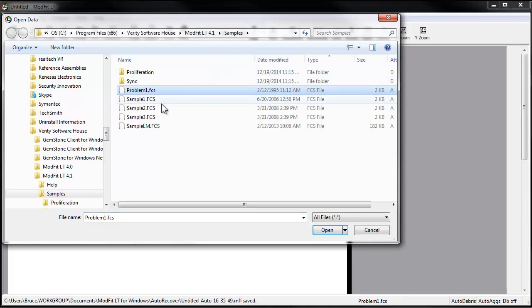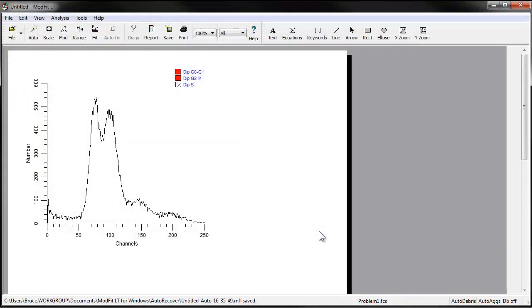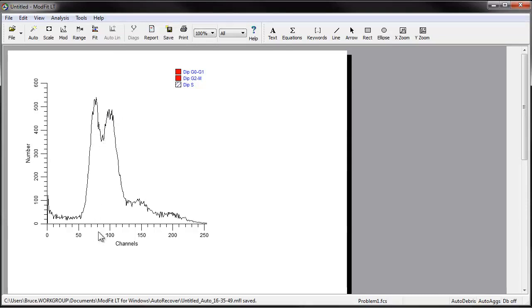There are several problems with this histogram, the most important being that its peaks are very broad. Depending on your Peak Finder settings, the program probably missed one or both of the dominant peaks in the histogram.